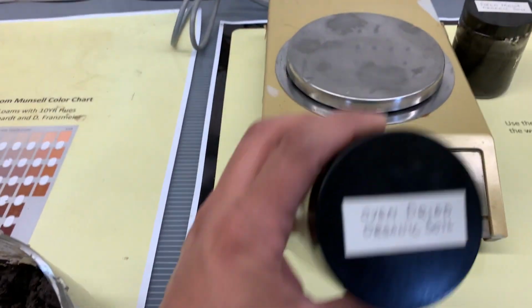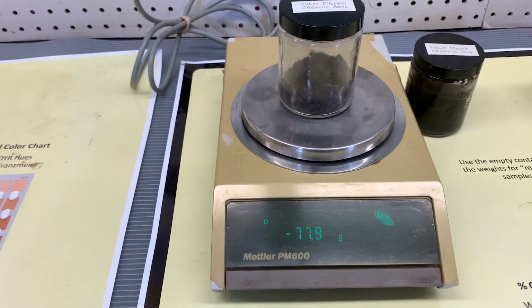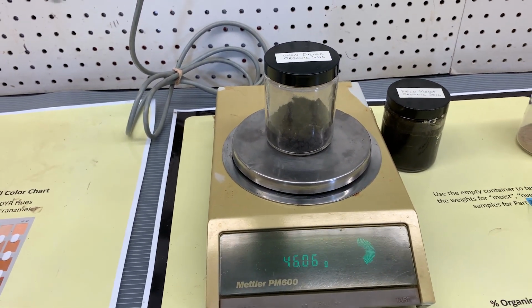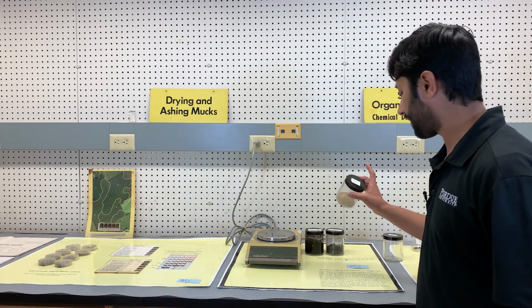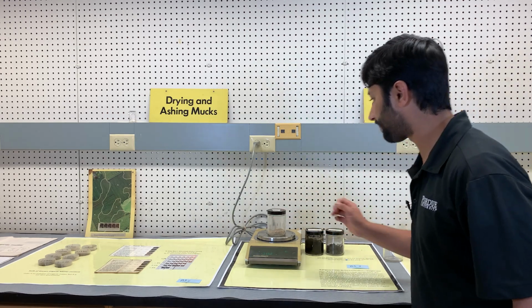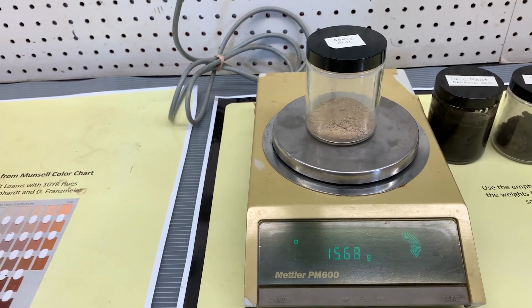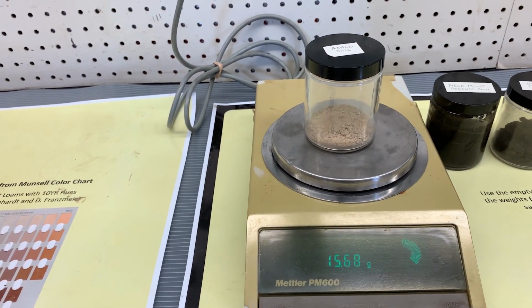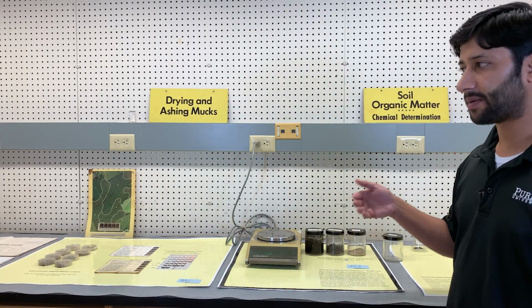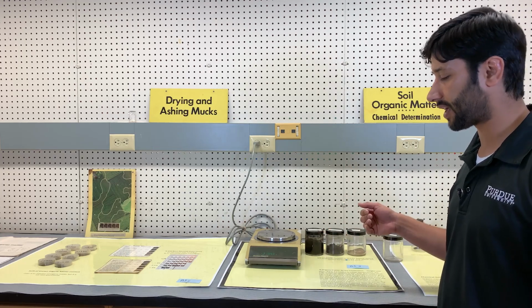Next, we will determine the oven dry organic soil weight, around 46.1 gram. And then we have the ash soil weight, and that will be around 15.7 gram. So based on these differences, you will be able to determine or calculate the amount of water that's stored and also the amount of organic matter in the soil.